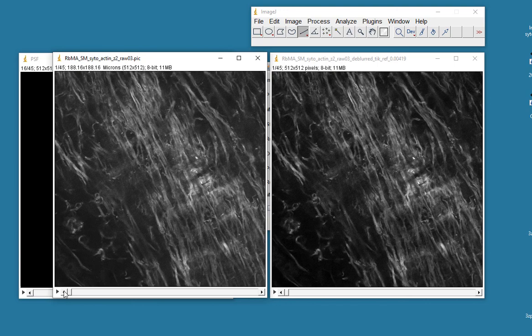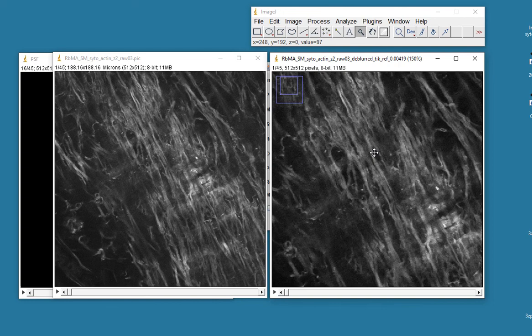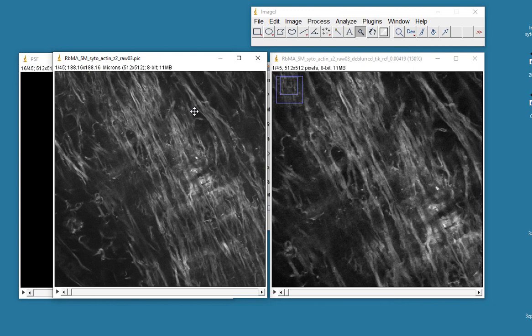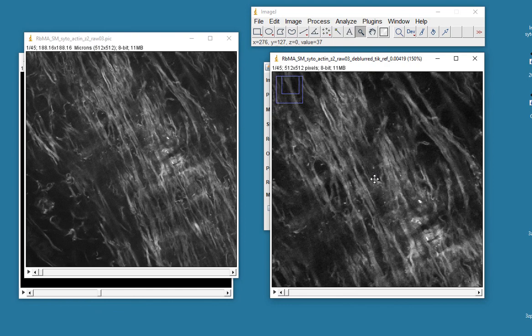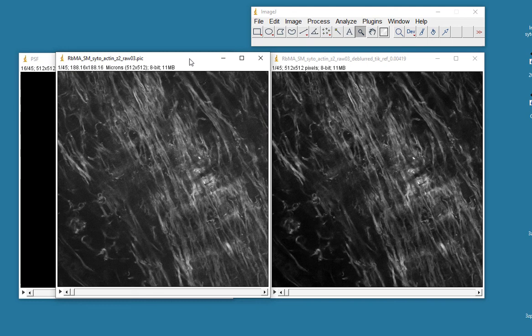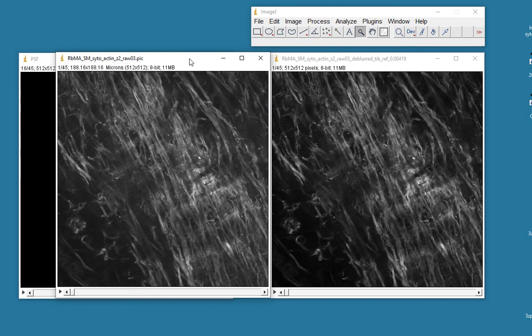Particularly clear here in this elastin or collagen structure out in the adventitia. I think there's certainly a bit more clarity if I was to zoom in in both of these. I went a bit too far there. Yeah, okay, I think you get the idea. Okay, so that's just a quick whirlwind demo of how you use the diffraction point spread function and the parallel spectral deconvolution. Works with some datasets quite well, doesn't work with others, but hey, that's how you do it. Okay, hope that was of some use.